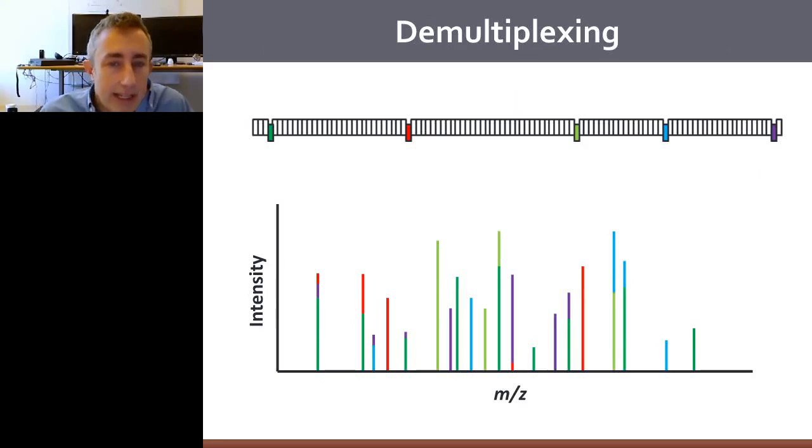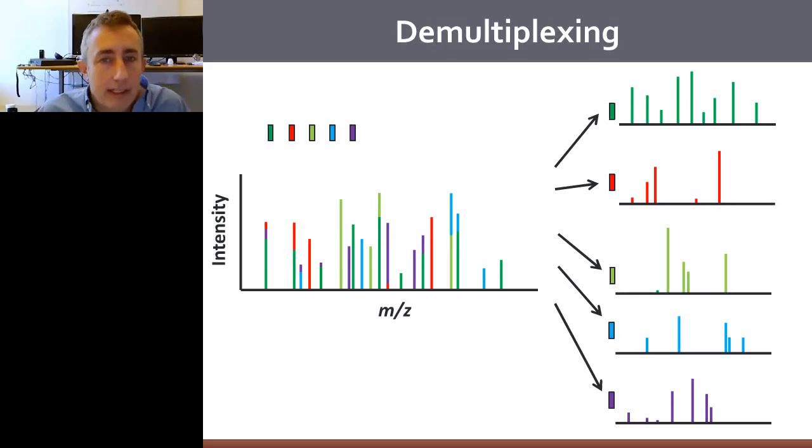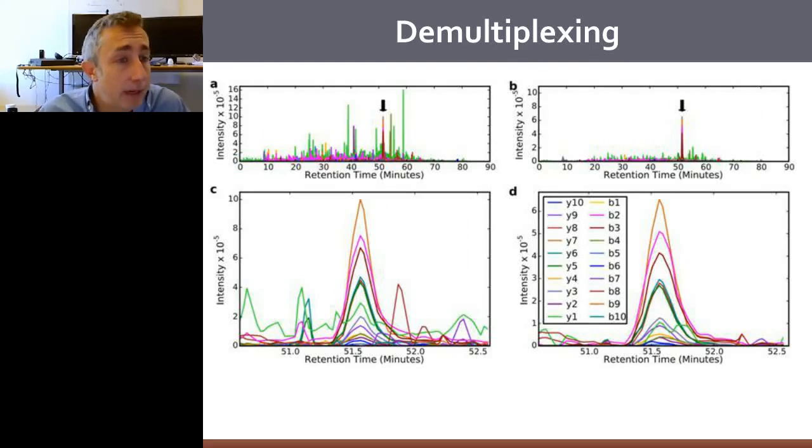So the idea here is, can we take this mixed spectrum that contains 5 combinations of 5 separate windows and ultimately demultiplex them into the 5 individual components? And I'll spare you the linear algebra and the math behind it, but basically, yes, we can. Here's the data shown measuring 20 mass charge worth of data in each individual scan. Here's the blow up of the data. And when you demultiplex it to the individual 4 mass charge wide isolation window, the data is much cleaner, much easier to assign the correct peptide location, and the quantitative data is much cleaner with better signal to noise.